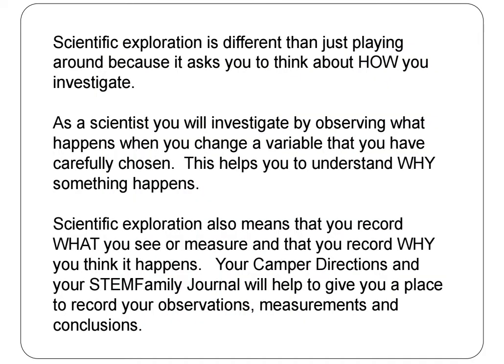Doing an investigation scientifically is different from just playing around. Scientists conduct their experimentation in a very deliberate way. In chemistry, it is crucial that the methods that are chosen to explore chemical interactions are chosen and ordered carefully. In this investigation, you will be separating a mixture by using one method at a time to remove each material.